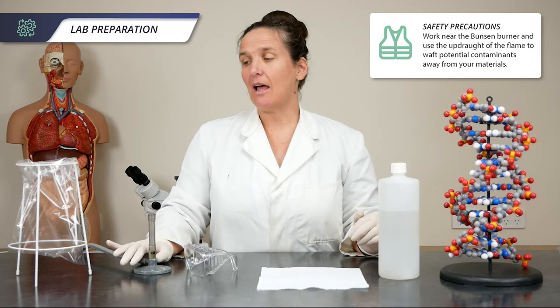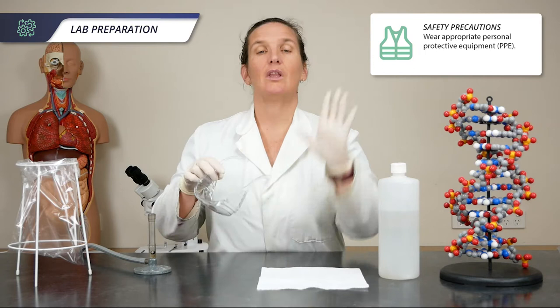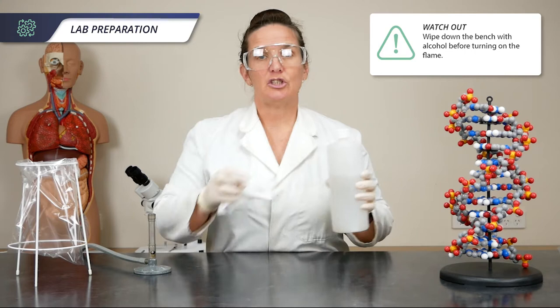First we're going to start with sterilizing our work area. I have a Bunsen burner here that I can't put on today, but we can use our imagination. I've got an autoclavable bag for waste, I've got 70% alcohol, disposable gloves, and my safety glasses.